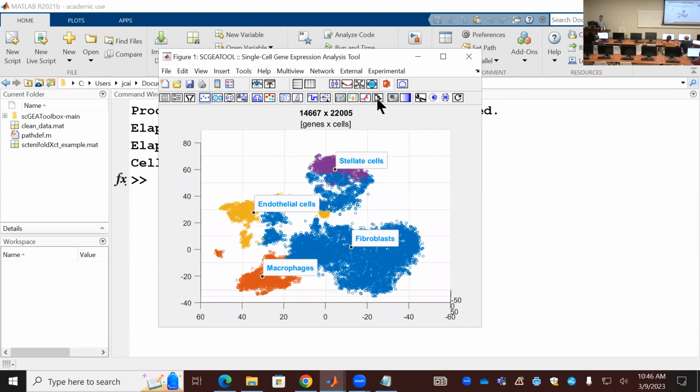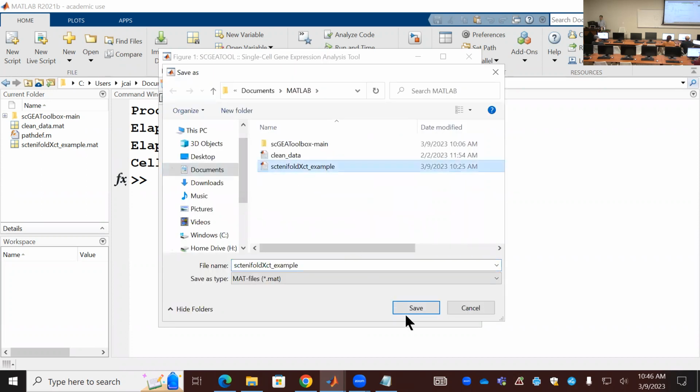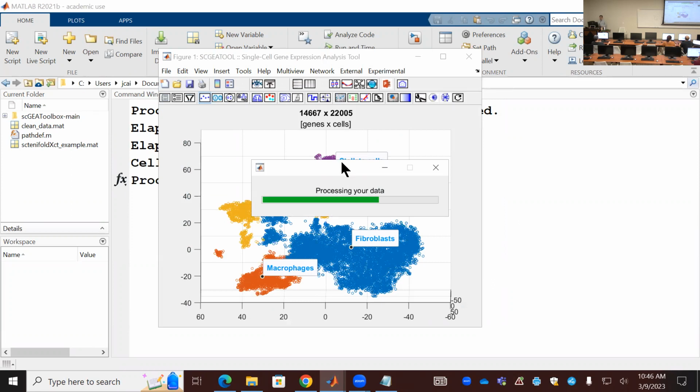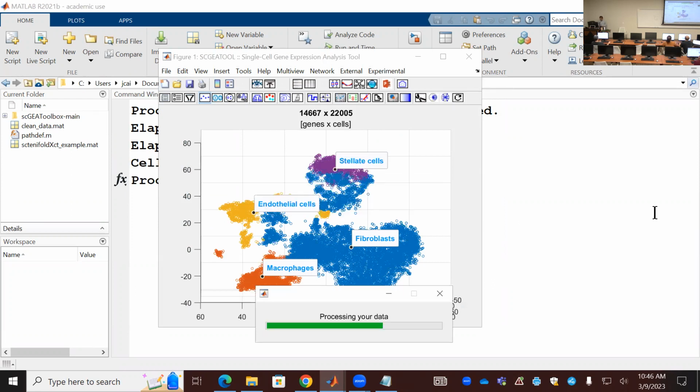Okay, at this stage, I'm going to save that file again, just before the break, okay?